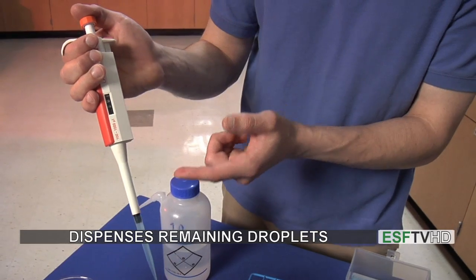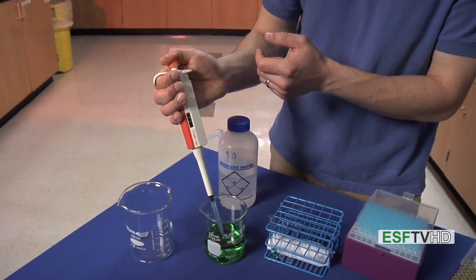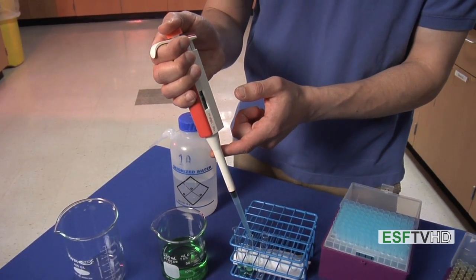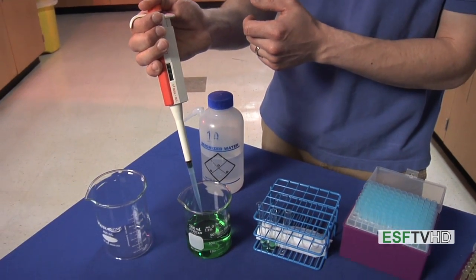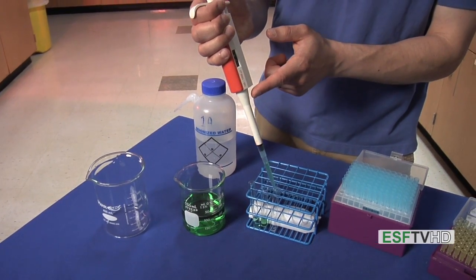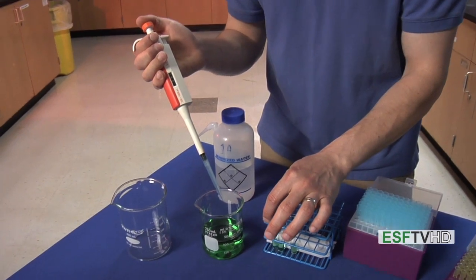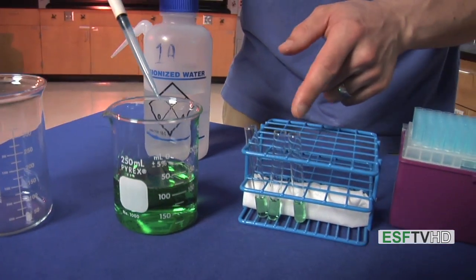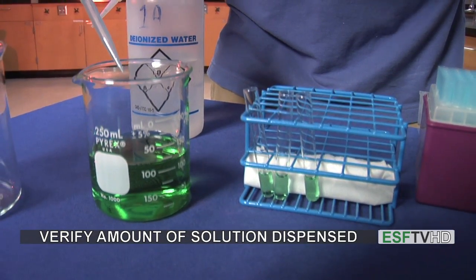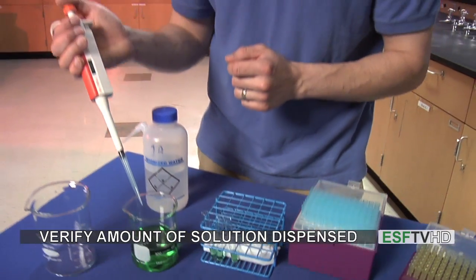I'm going to repeat it two more times: pushing down, withdrawing slowly, and dispensing, pushing all the way down to push out any extra liquid. And one more time — withdraw, dispense, and push all the way down. You can see on this white backdrop that we have three different test tubes filled with the same height of solution. You should take a look at your solutions as you use the micropipette to make sure they are all the correct heights, which gives you an idea about the correct volumes.